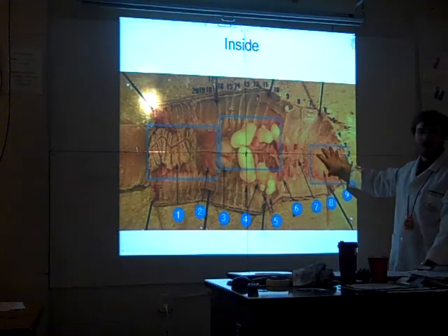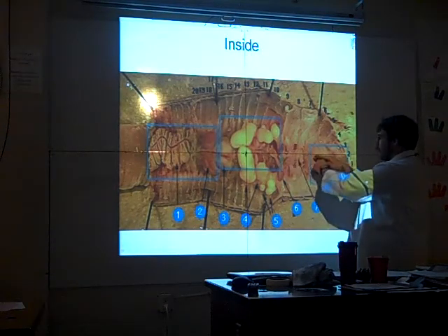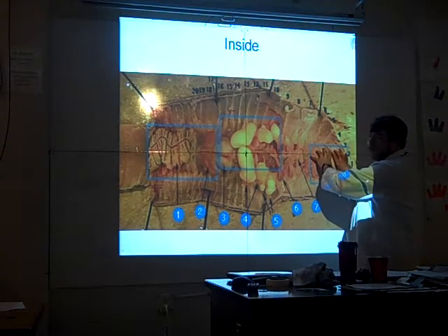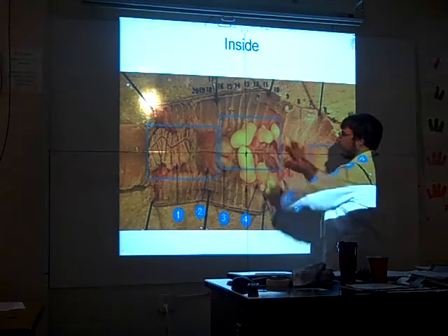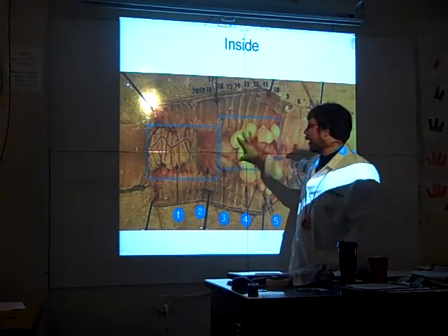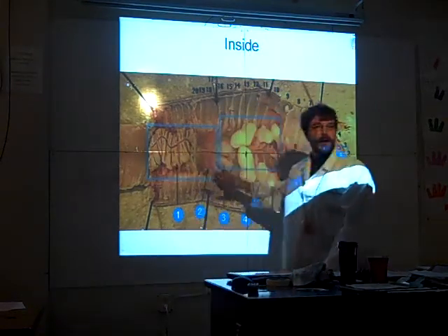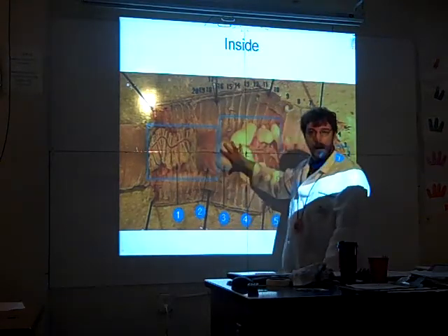You see a big muscular bulge right here. A lot of people start the cut here, so when you're done, you might need to cut the rest of the way up. Right here, this is where the pharynx will be. This tube that's kind of blurry right here is the esophagus. All these white bits are its sex organs. Underneath that, you have the crop and the gizzard and then the intestine. I find it's easiest to identify the digestive organs by starting with the intestine and working your way up.